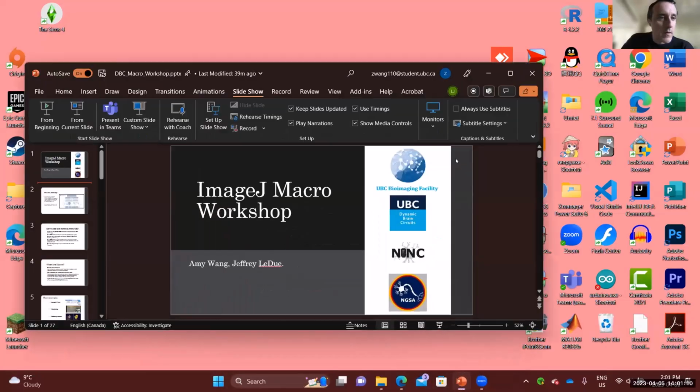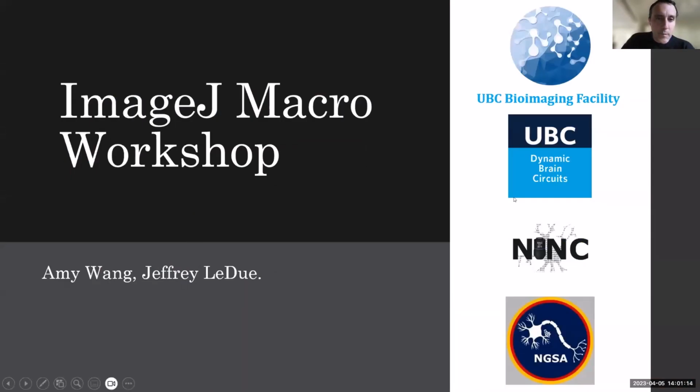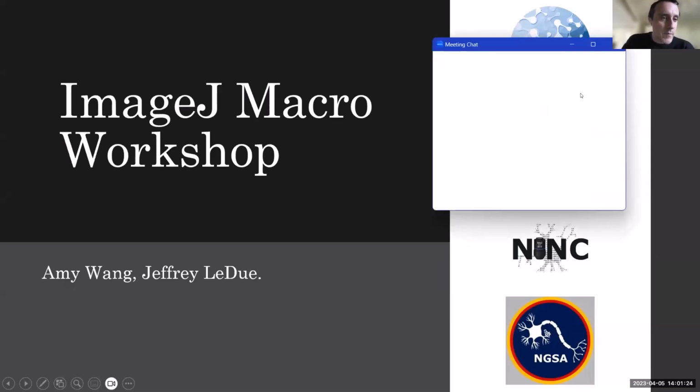Thanks, Hannah. So if anyone has any more questions about what Hannah presented, feel free to throw questions into the chat while we're diving into part 3. Part 3, we're going to extend what Hannah was hinting at when she was talking about her larger macro.